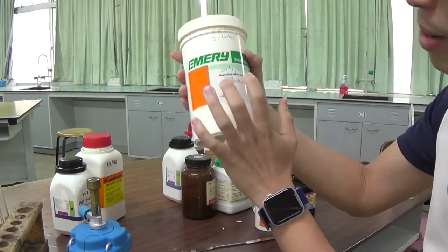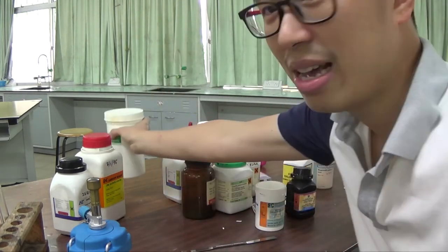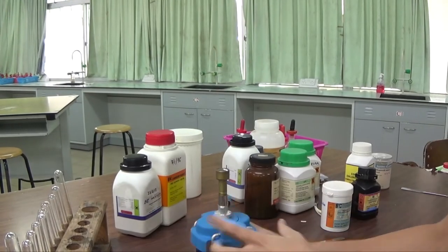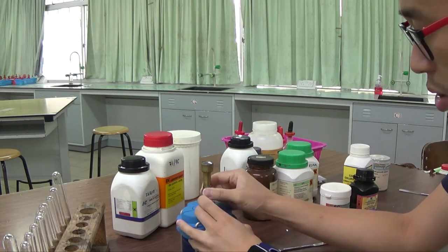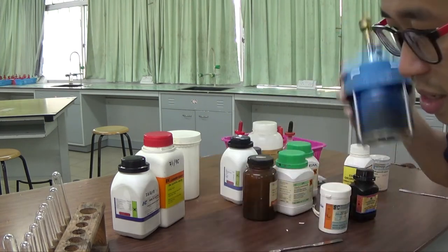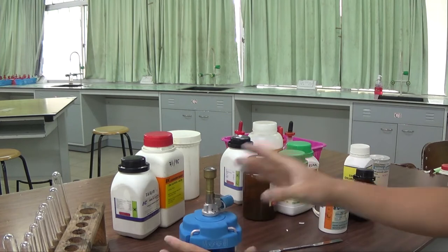Here I already know it's magnesium sulfate, but if you don't know what it is, then you can see exactly what happens. Okay? Before I turn on my Bunsen burner, make sure the gas valve is closed. Let me just check if there's gas in here. Yep, there's gas in here.